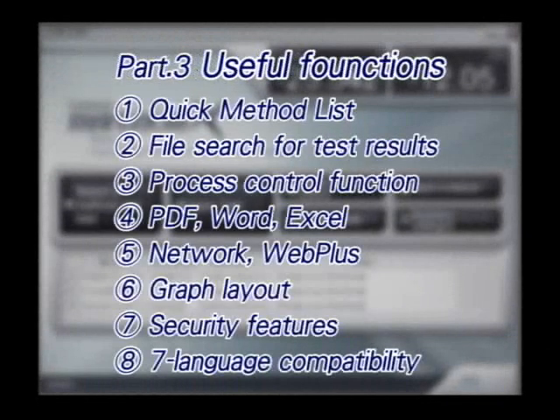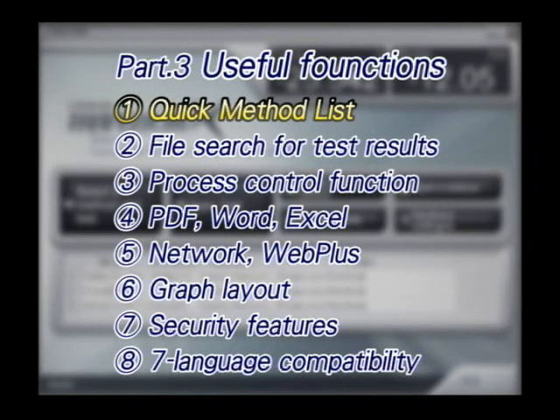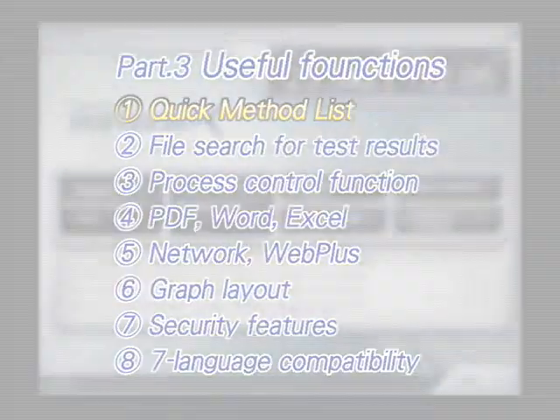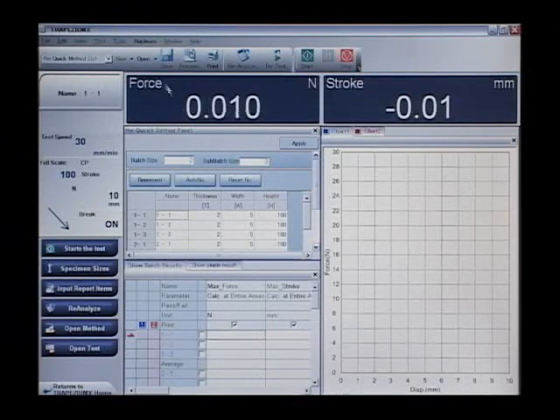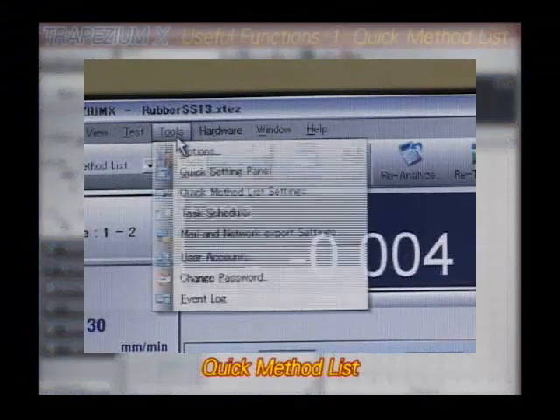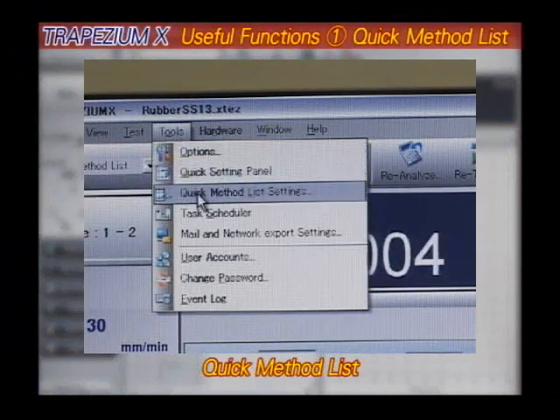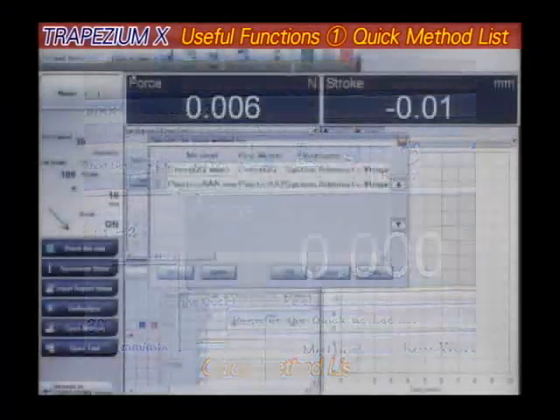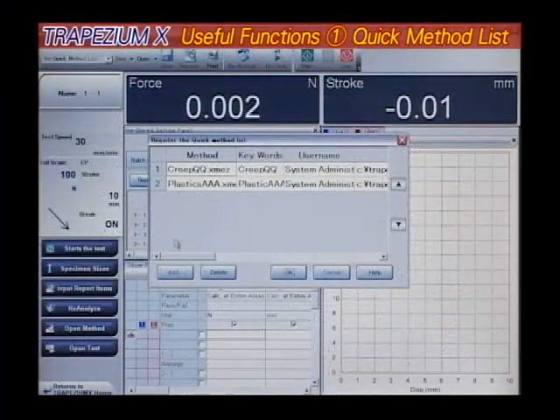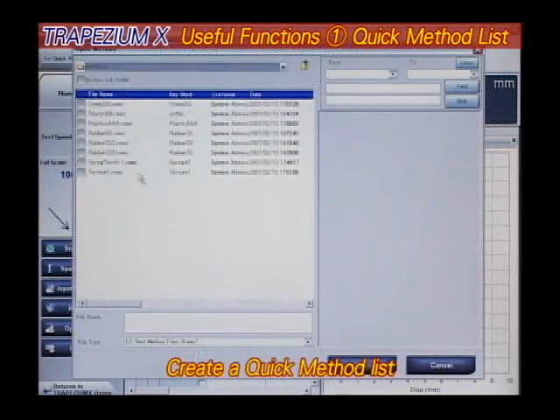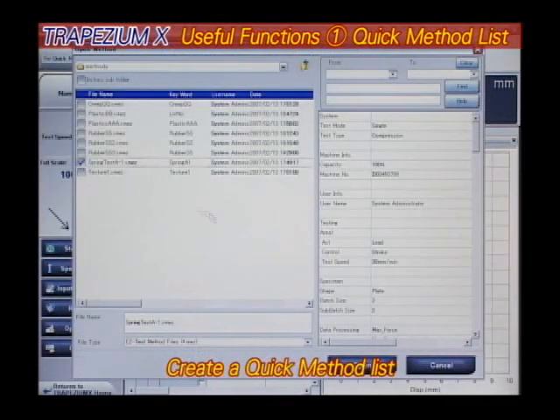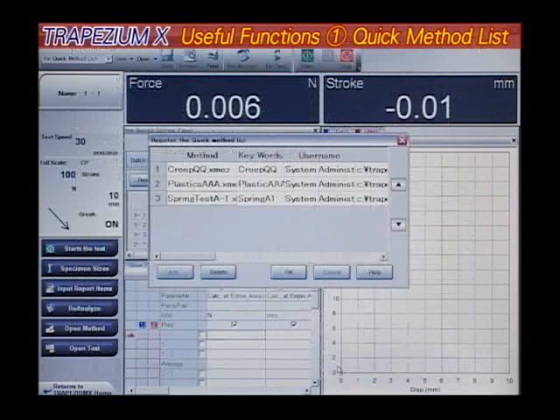Additionally, the Trapezium X software includes a number of other useful features. Quick Method List: registering previous tests and parameter settings allows you to recall those settings in a single, simple step.